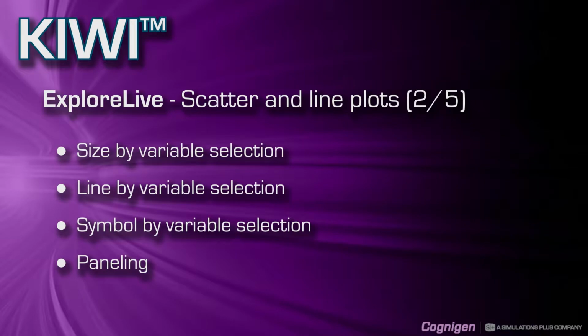Welcome. This is the second video in a series of 5 dedicated to the creation of scatter and line plots in the KIWI ExploreLive module. I will cover the stratification functionality of ExploreLive.